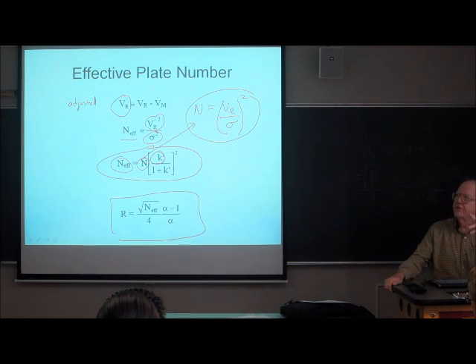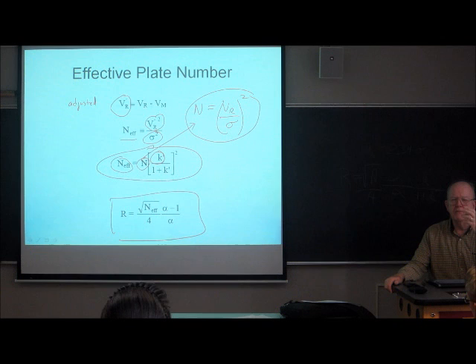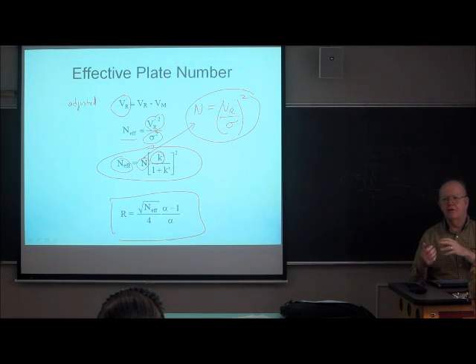Or, to put things even in a slightly more modern context, in liquid chromatography, until maybe 5 years ago, we used particles that were completely porous. But now we're using particles which are partially porous.